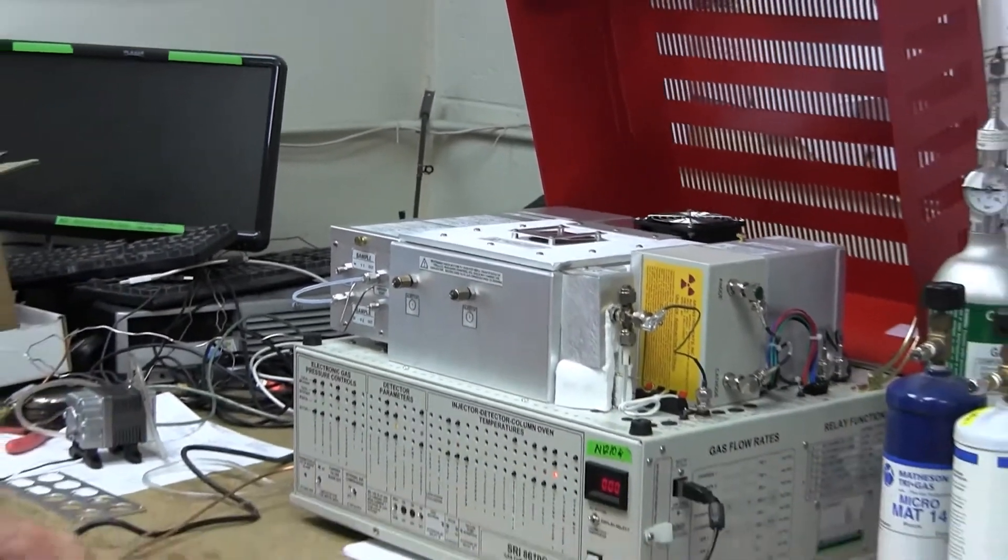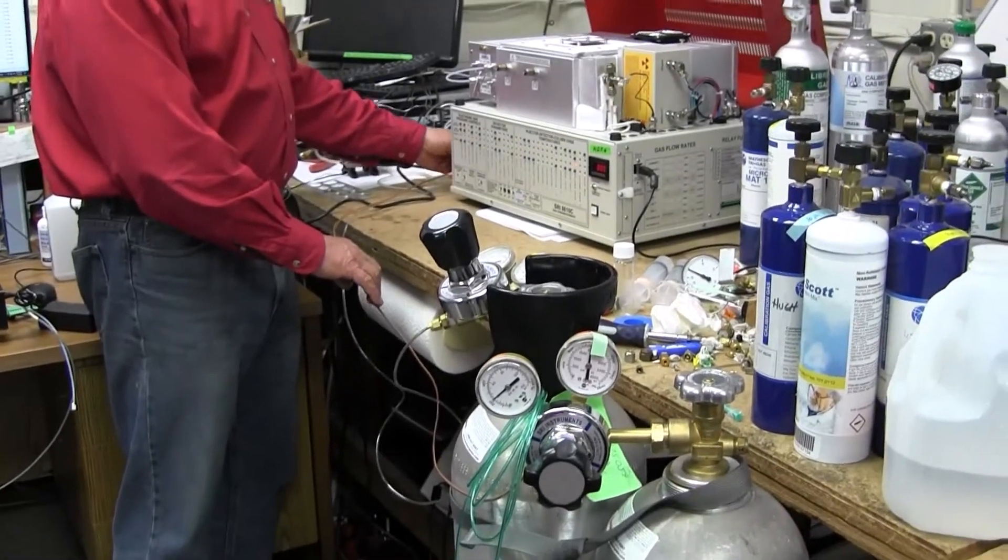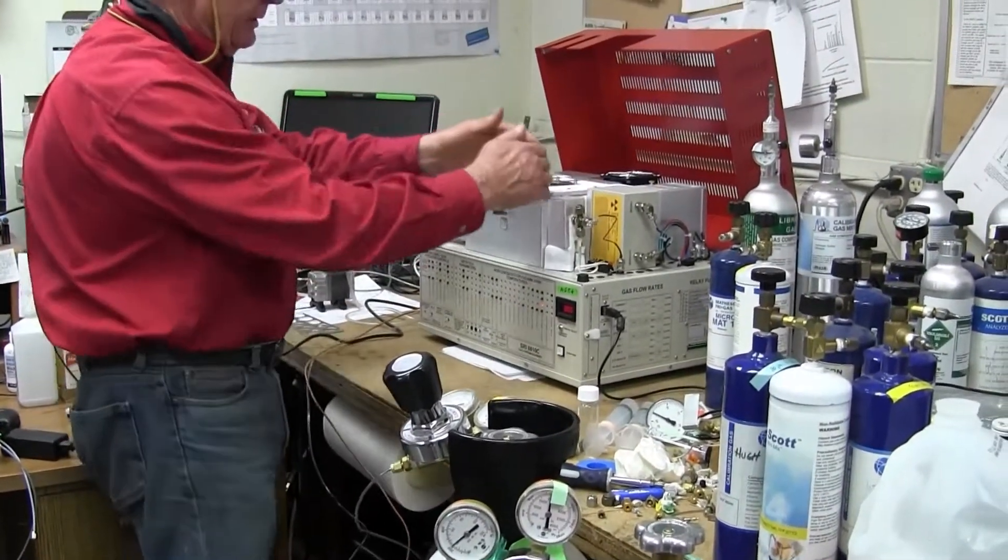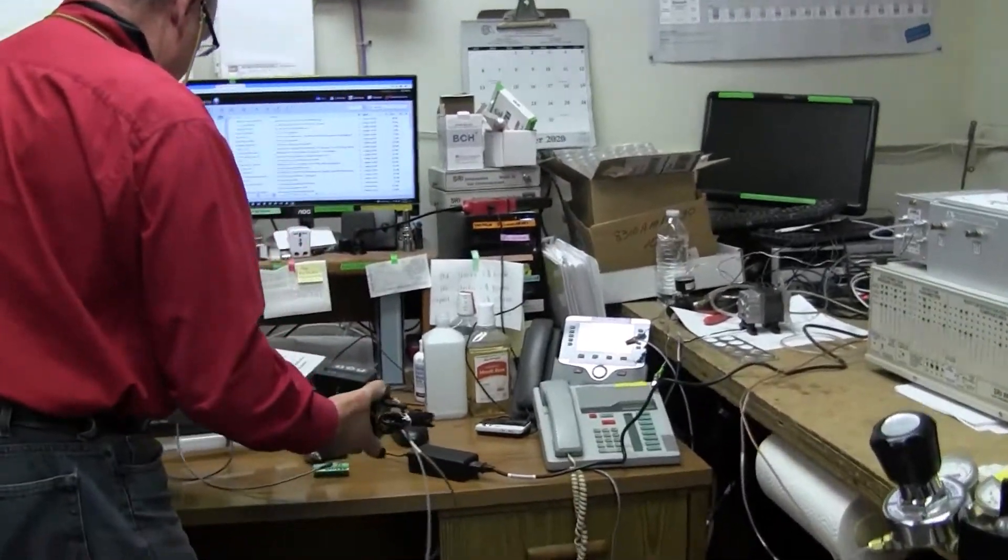So I've got my gases hooked up to the GC. I've got my argon for the TCD, and I've got nitrogen for the ECD and the FID methanizer, and then this is the auto sampler, this box here.